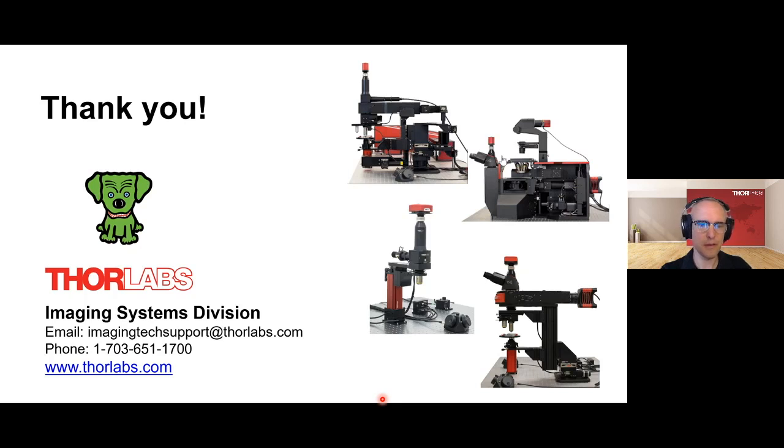We have time for a few more. What is the difference between wide field microscopy and confocal microscopy? Are fluorescence microscopy and bright field microscopy also wide field microscopy? Okay. There are multiple elements to that question.